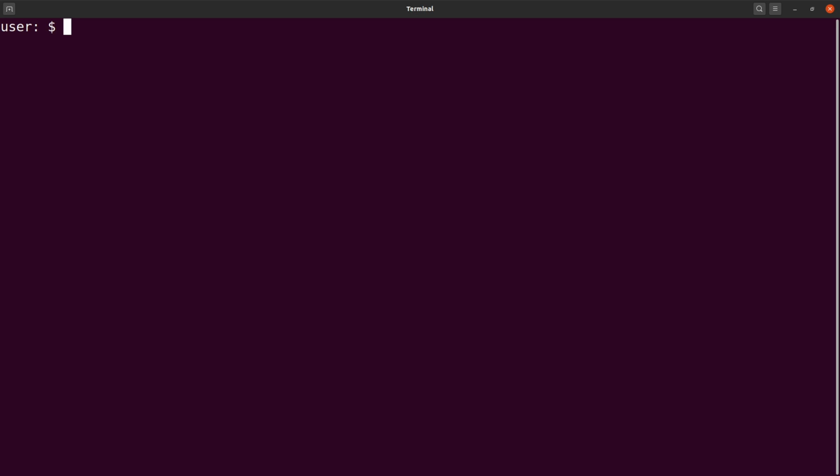So let's proceed. Let's say you want to look for this sample, NA21112, the one I am displaying right now. We want to check whether it has records in the VCF file. We can say bcftools query -l, we call the VCF file, and we say grep, and then we specify the sample ID.